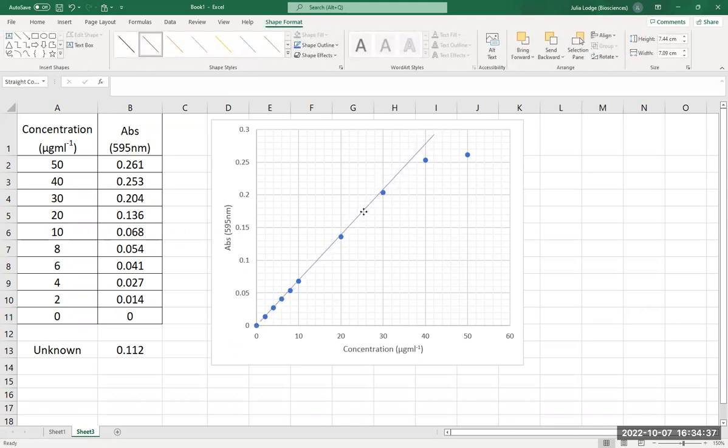So you can see, I think you'll agree with me that our data is quite linear over the first part of the calibration curve, but that these 2 points really don't fit on this straight line. And that's really important. Have a look at your data. I'm just going to park that straight line out of the way for the moment.